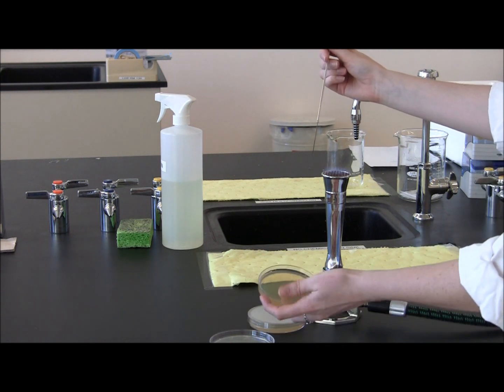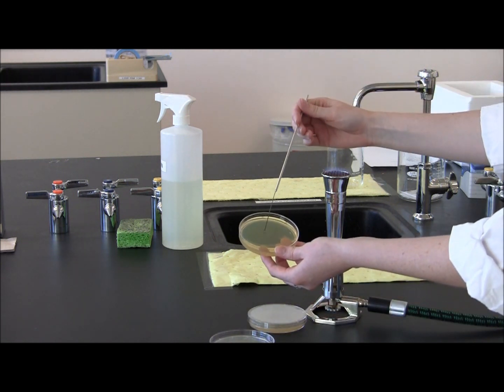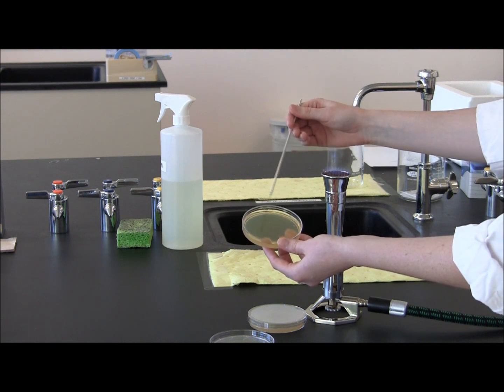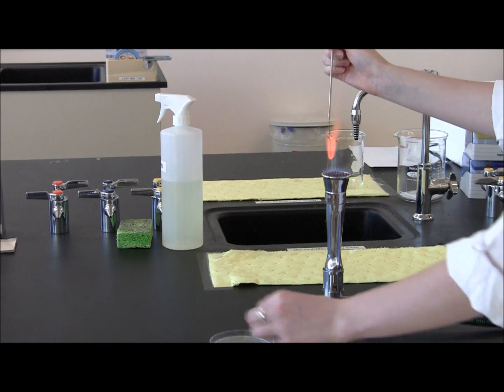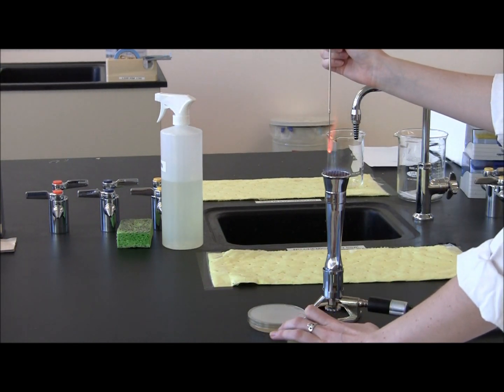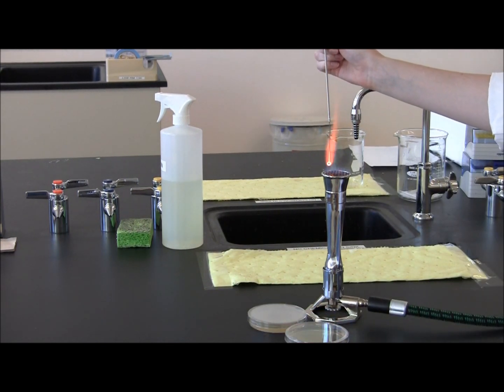Now you are doing your last isolation streak, which should not touch any of the other quadrants you have streaked on the plate. Flame the loop when you have finished, let it cool, and then put it back in the drawer.